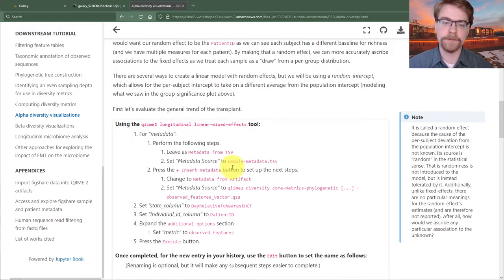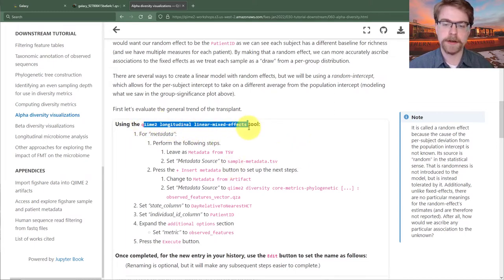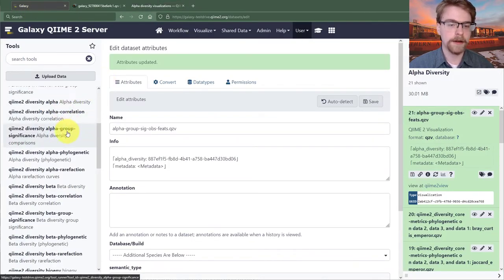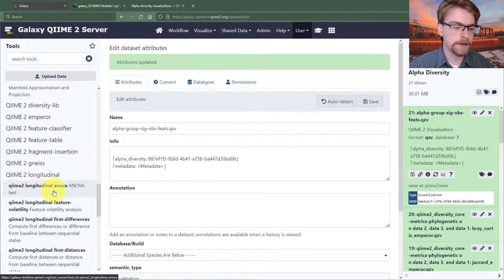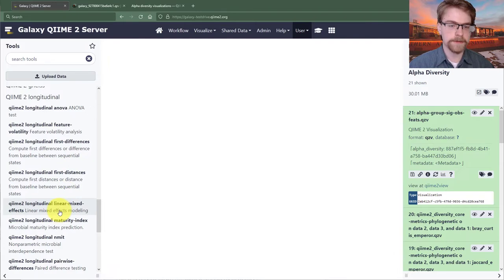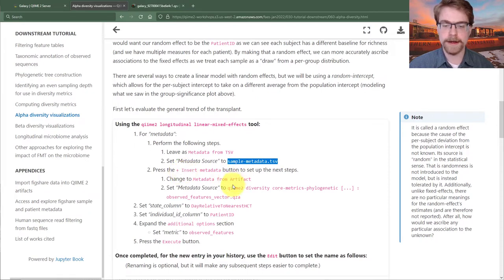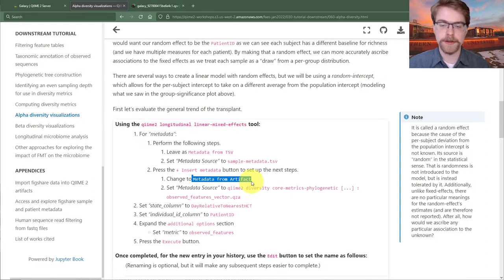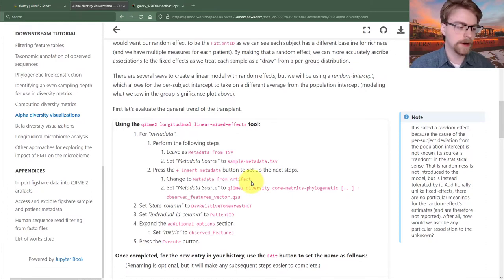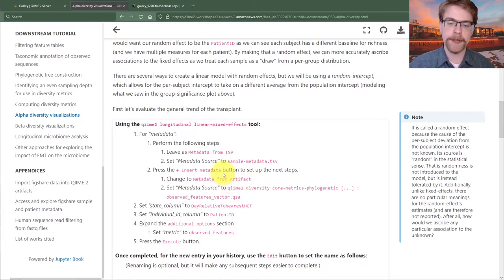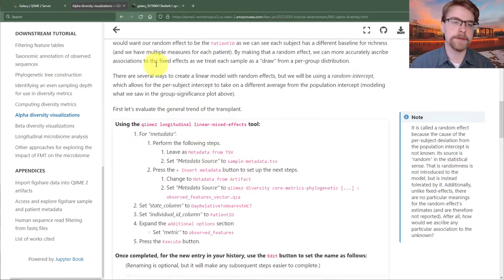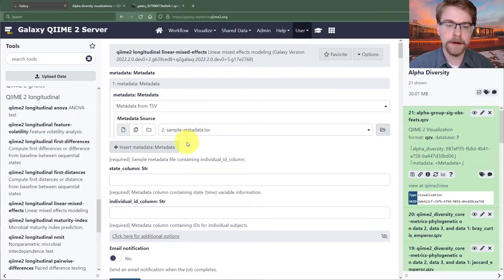We're going to use QIIME 2 longitudinal linear mixed effects. Going back to Galaxy, we find the linear mixed effects tool. The instructions say to use our sample metadata, then insert another metadata — this will actually be metadata from an artifact. One of the nice things QIIME 2 can do is treat artifacts as metadata. We're going to combine the richness for each sample with the sample metadata, since they share the same structure.